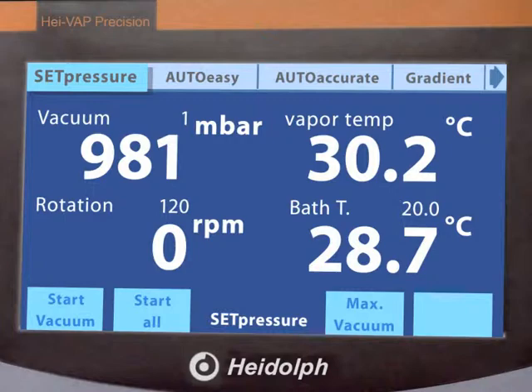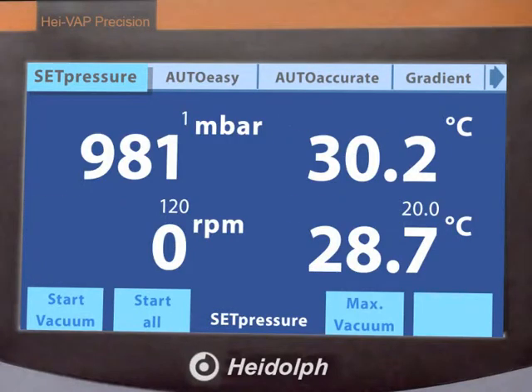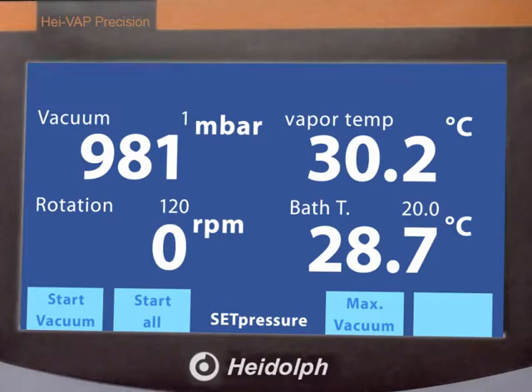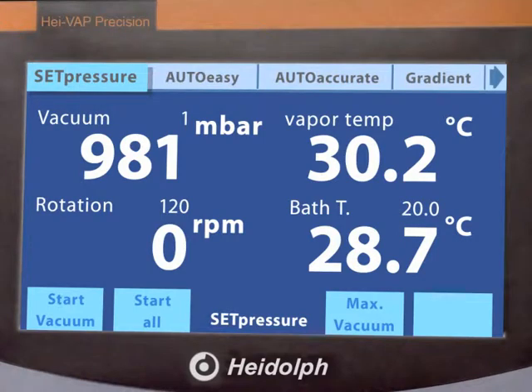Experience the advantages of the large 4.3-inch colour graphic display, which features all parameters and integrated vacuum control. The clarity of this innovative display is simply unique.